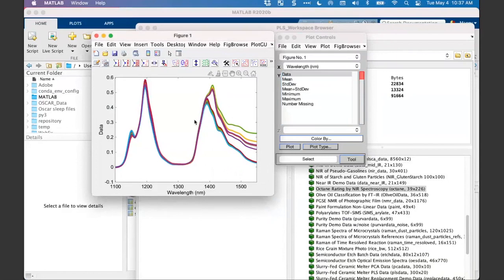So one thing that I know now is, if I have classes in the dataset object, I can look at them just by pressing the class. And yes, we do have 2 classes there. But sometimes, for classification problems, we usually want to see the class. But for regression problems, there is another way to convey that in this kind of 2D representation, and that is by using color by.